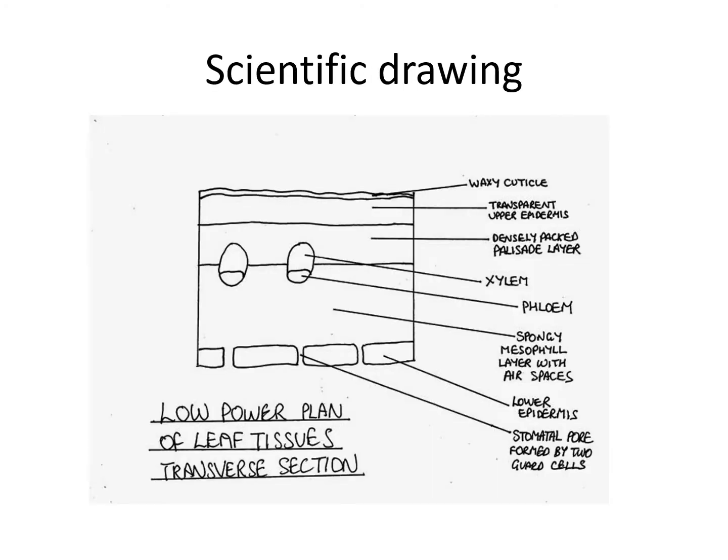So first of all, you need to remember how to do scientific drawings. Now a low power plan is just the bare bones. It would just be like if I was drawing one of the labs, you would just do where the doors are, the windows are, and the benches. And then a high power detail, you would take perhaps a bit of the front bench and you would draw the people and the chairs and the bags and the coats and the pencil cases and all of that kind of stuff. So you'd have much more detail.